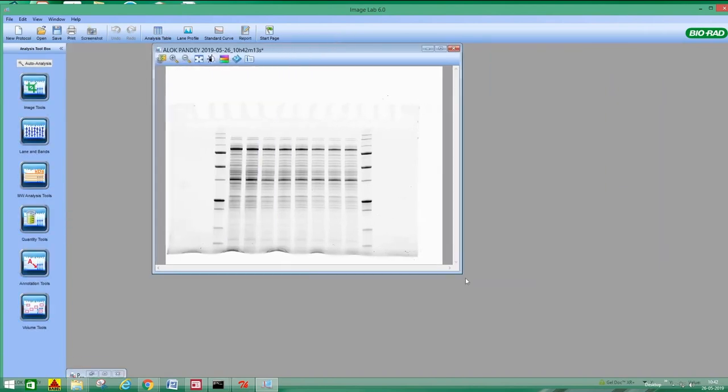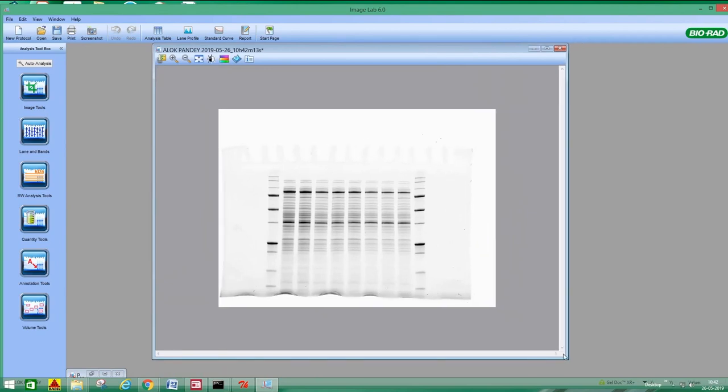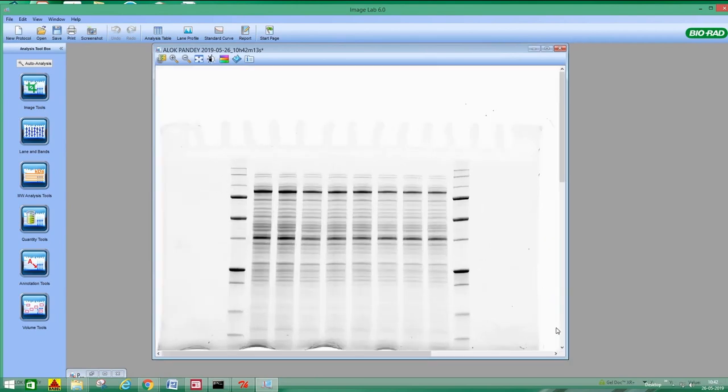So this is our gel image. This is the molecular weight ladder, first row and last lane, and these are the fractions. So we want to analyze how many different bands are there, the first component, what is the intensity of these bands, and what is the molecular weight. So I will try to show one by one.